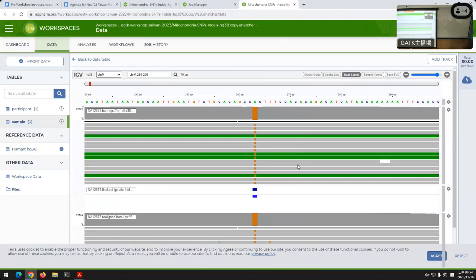So the question was, because the mitochondria is such a small fraction of the total DNA, the regular QC metrics that we use on calls might not be fit for them. And should we take metrics separately on the mitochondrial DNA? It sounds like a good idea, but I actually don't know what they do in practice for this. Do you know what they usually do, Eric?